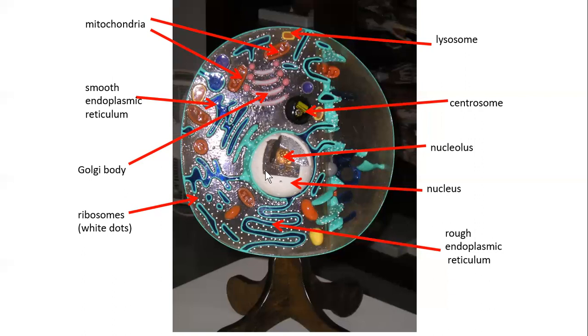Spherical structure. The major biological component of the nucleus is DNA, deoxyribonucleic acid, and the function of the nucleus is to store hereditary information. Our genes are located on those DNA molecules, the chromosomes inside the nucleus. In a smaller corner of the nuclear region, there's something totally different.